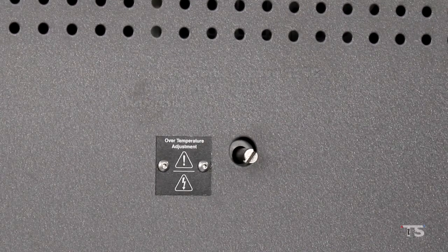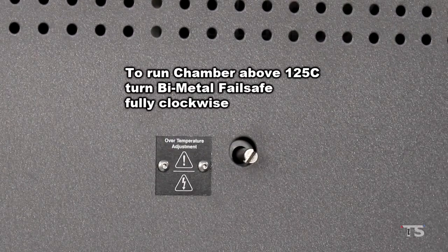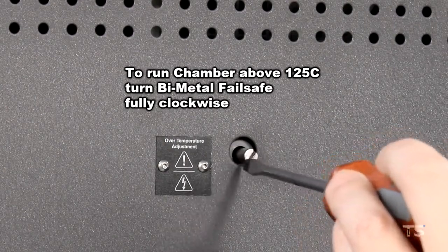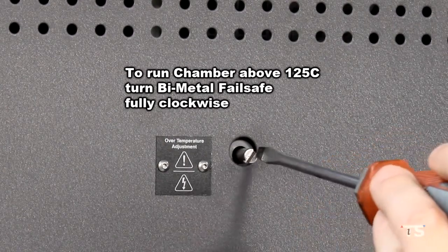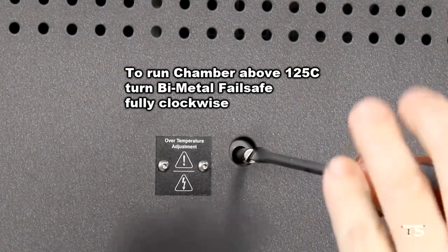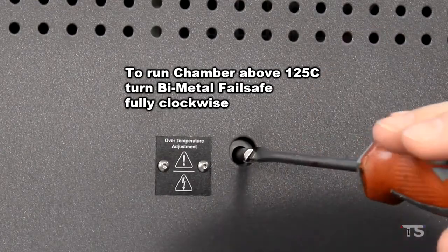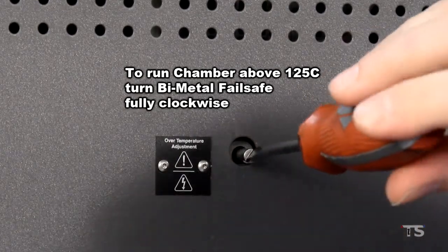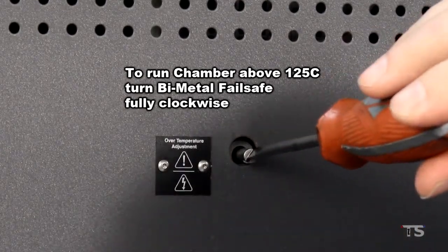Should you ever need to run your chamber to a temperature above 125 degrees Celsius, you will need to turn your bimetal failsafe fully clockwise.